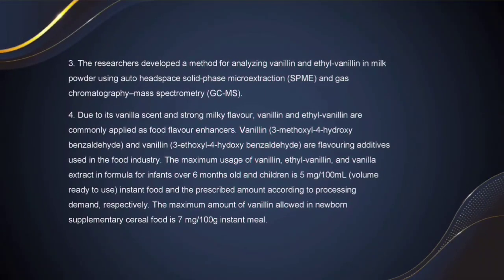The researcher developed a method for analyzing vanillin and ethyl vanillin in milk powder using auto headspace solid phase microextraction and gas chromatography mass spectrometry. Due to its vanilla scent and strong milky flavor, vanillin and ethyl vanillin are commonly applied as food flavor enhancers.